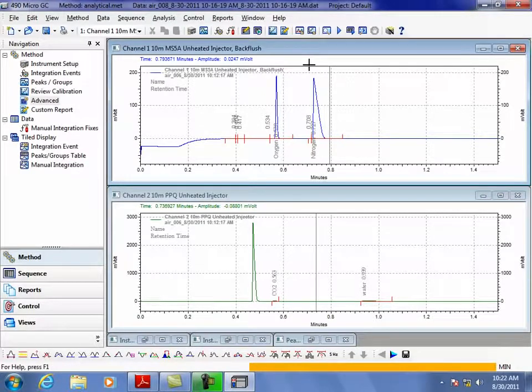But somebody will have to sit here and go through those for it to make sense. And the way that we have it set up, it does the analysis automatically based on what we've calibrated into the analyzer. So you do a run, it automatically does the analysis, so you can look at the report. So it's all finished.